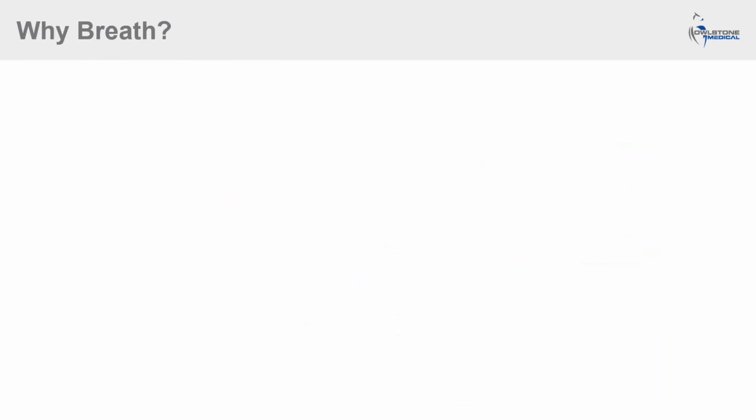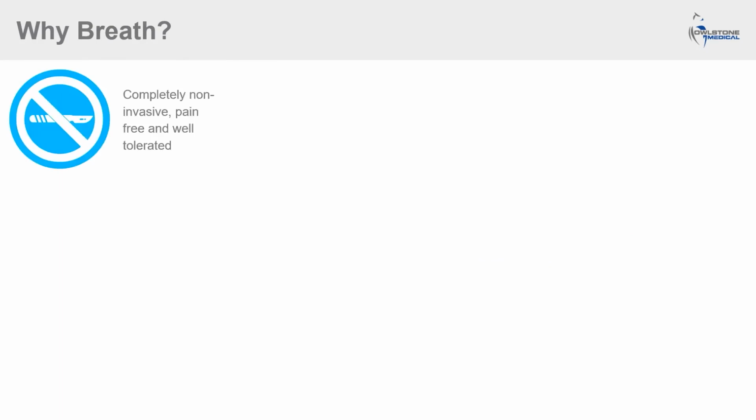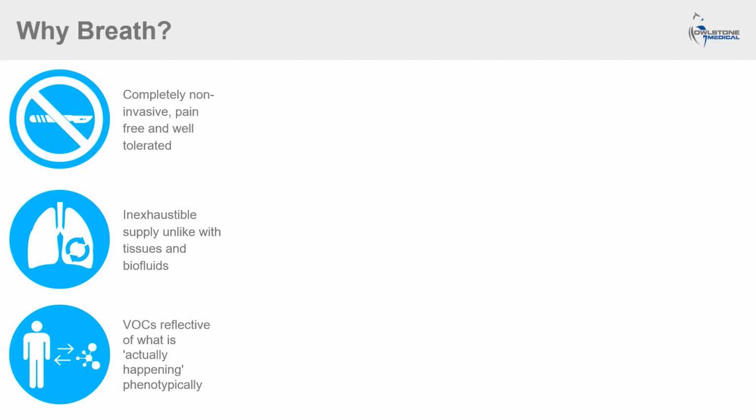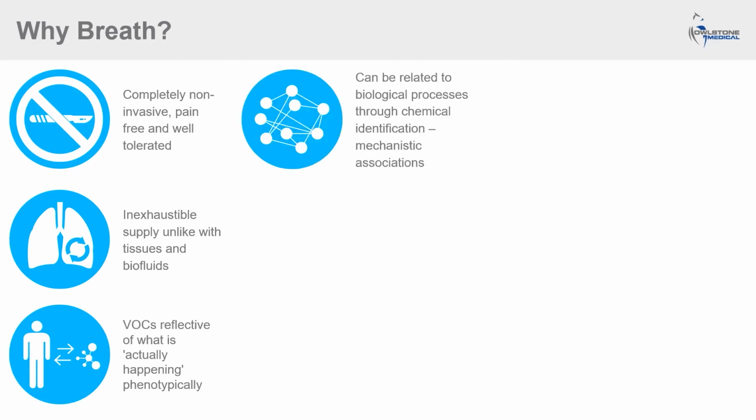Why breath? We think there are quite a few compelling reasons to consider breath analysis. It's completely non-invasive, pain-free, and well-tolerated. Unlike with tissues and biofluids, there is an inexhaustible supply. VOCs represent what is actually happening phenotypically, providing a dynamic view of current metabolism and disease biology. Our process that I will describe later allows us to identify the VOCs present rather than relying on pattern recognition, which can be difficult to relate back to underlying biology. By identifying the VOCs, we can relate these to biological processes.